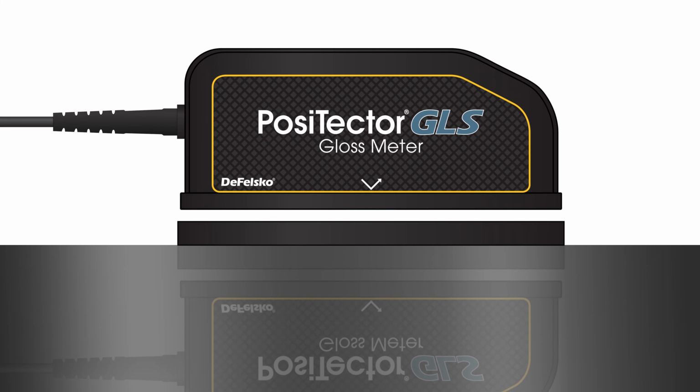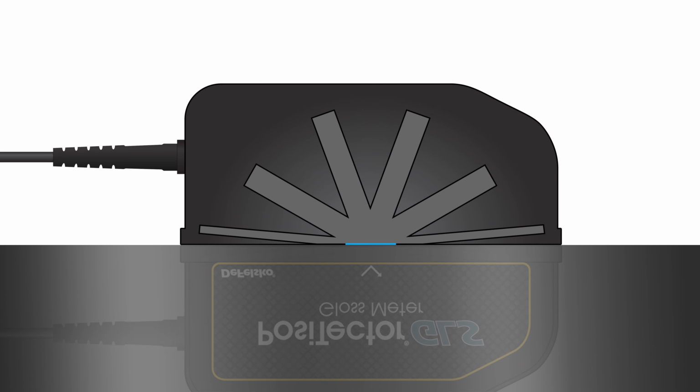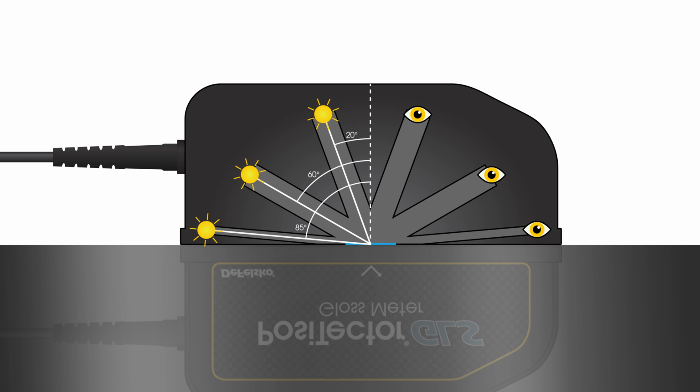Because of the vast range of gloss values, different measurement angles are used to provide the best resolution across matte, semi, and glossy samples. The 60-degree measurement angle is the recommended starting point and is used to measure many common finishes such as interior wall paints, furniture, packaging materials, and plastics.